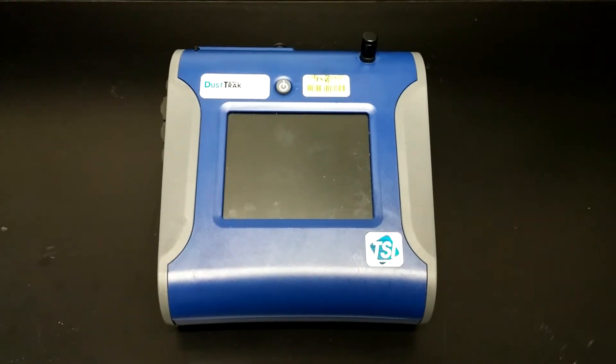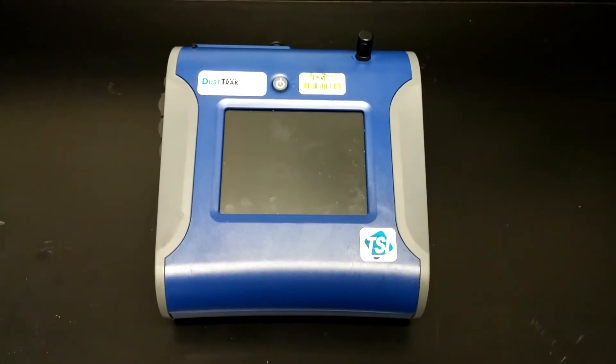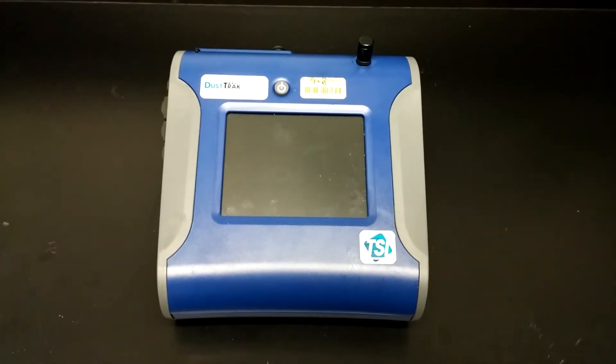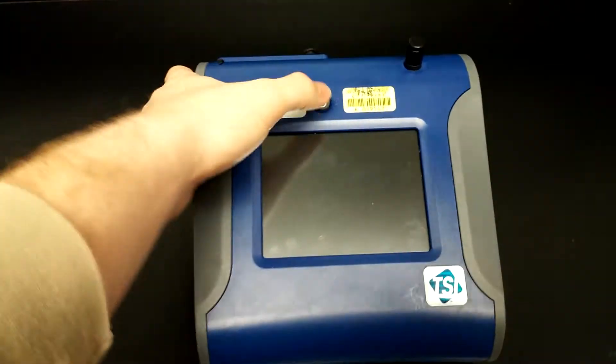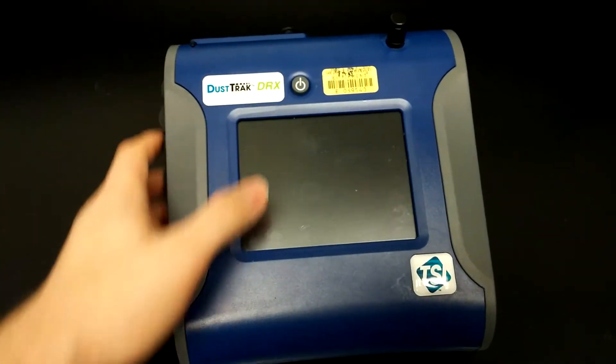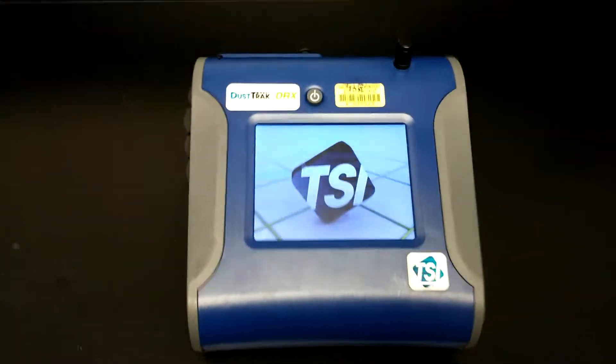Before we can set the logging interval, time constant, and run mode, we need to first turn the DRX on by pressing the power button.